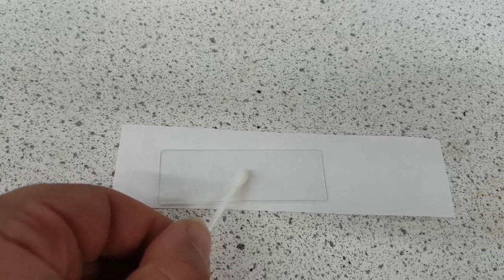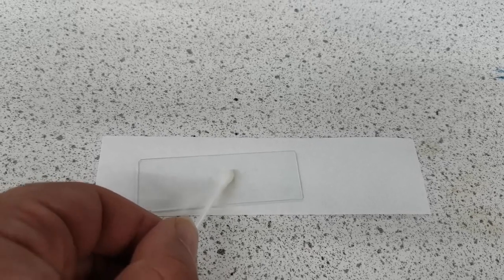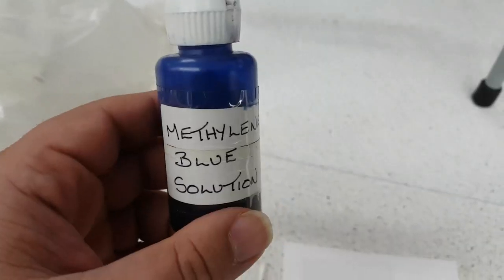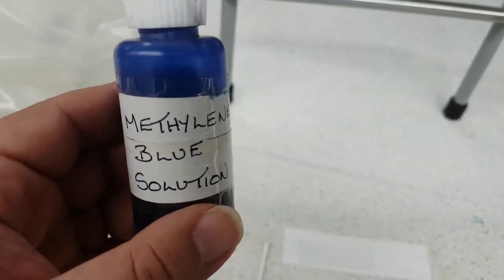Then what we need to do is we need to add a dye so that we can actually see the cheek cells under the microscope. So the dye that we are going to be using is methylene blue solution.